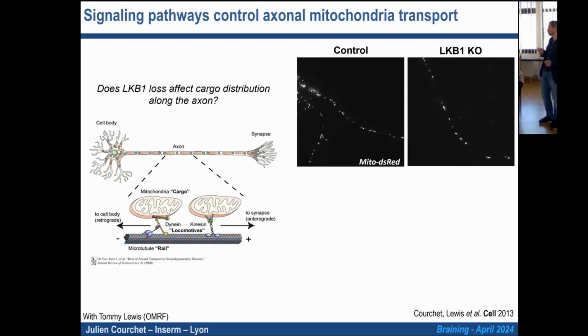If you look at mitochondria in immature neurons, 5 to 7 days in vitro, roughly 65–70% of them would be fairly stationary. They are at a given position and they would not move too much over the 30 minutes that it takes for us to do the movies. And then 30% of the mitochondria would be moving and mostly directed toward the extremity of the axon. So this is what you would see here, that those mitochondria sort of sit locally, and then from time to time, you see one that crosses the screen.